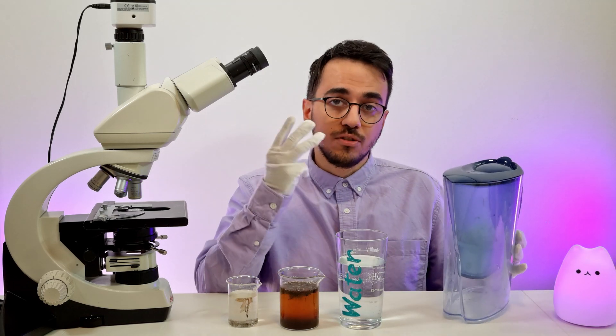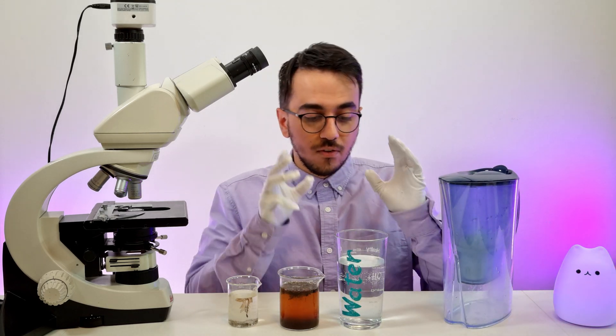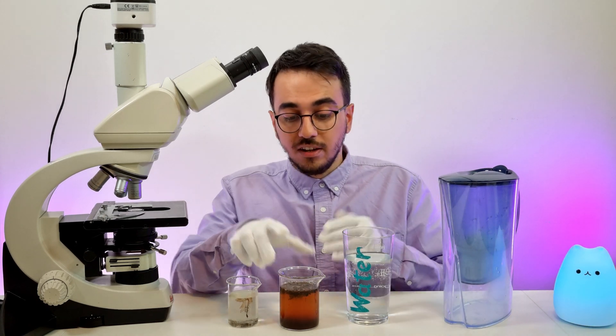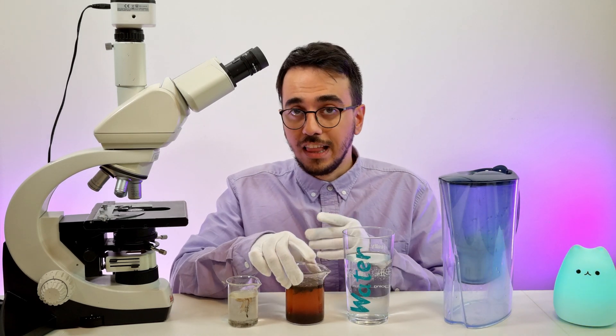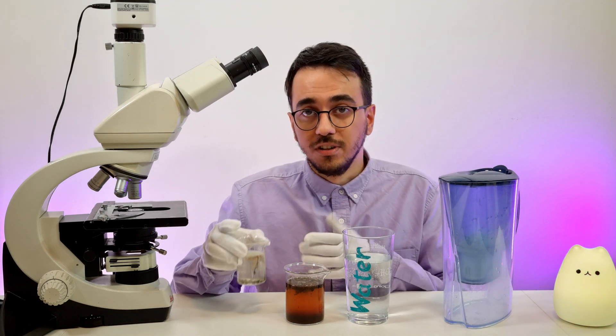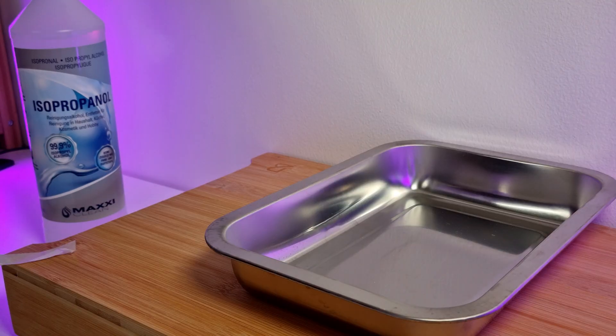I've got a Brita filter here and I'm going to do three different experiments. First I'm going to use tap water, then water mixed with soil, and lastly I'm going to use water that contains microbes and bacteria. We're going to test it using this microscope.